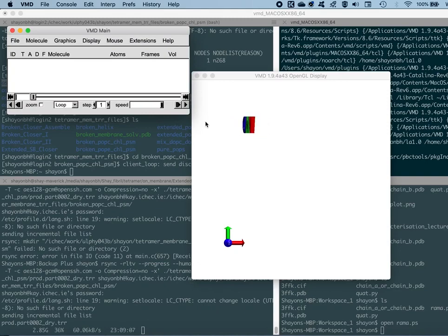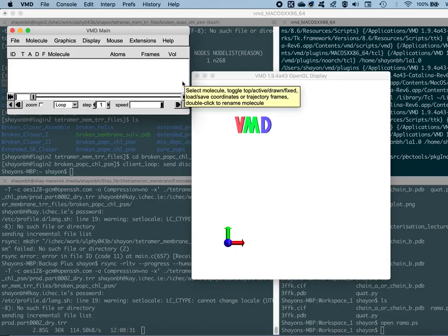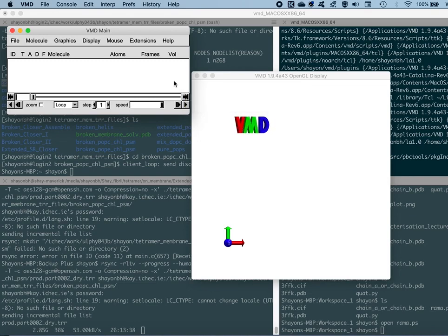So in this tutorial, we'll see how to predict the dynamics of a protein structure that we just obtained from the Protein Data Bank by its temperature factor or the B-value. The temperature factor or the B-value occupies the identifier 11 in the PDB file format if you open that in the text format, and that just follows the occupancy which lies in the identifier 10 of the PDB file.